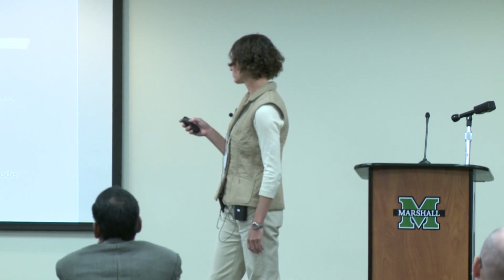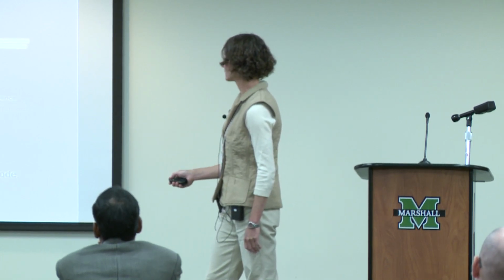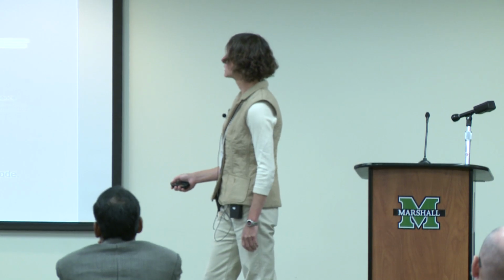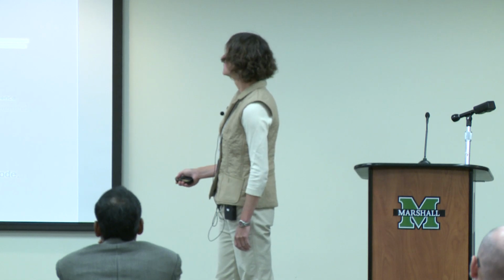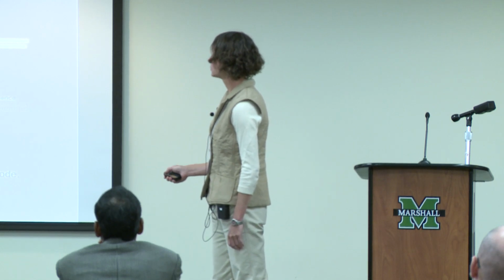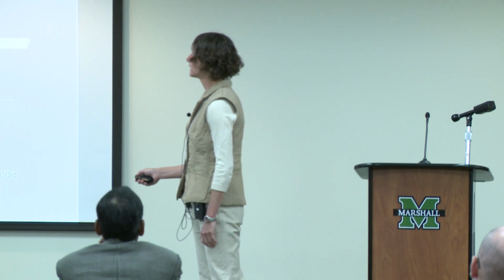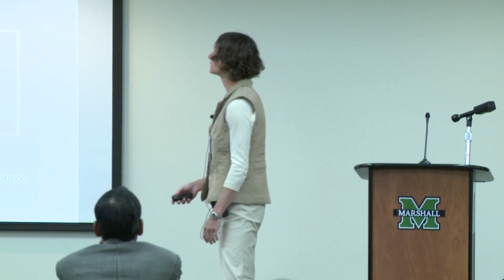You can sequence the patient's genome, which you see here visualized, as I've alluded to, as these sets of overlapping reads with short bits of sequence. And you can align them to the reference genome sequence, which in this case is the human genome. You can see, for example, this person has mutations in these two places here in what would represent a gene. And this may, for example, predispose this patient to a certain disease, or it may actually recommend a useful course of therapy for that person. So that's sort of best case scenario when you're just mapping to a reference genome that's already been sequenced.